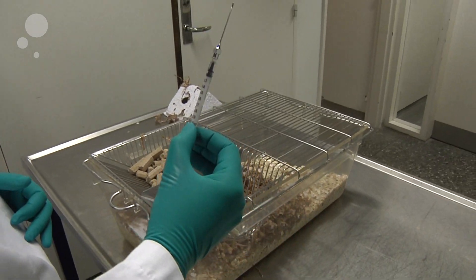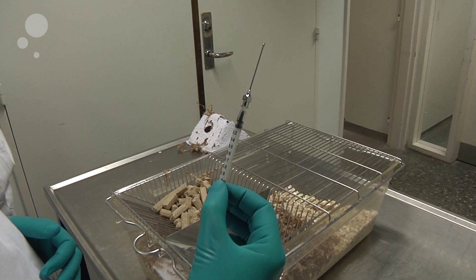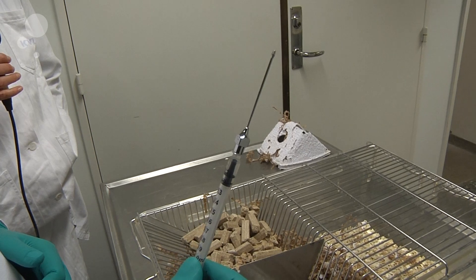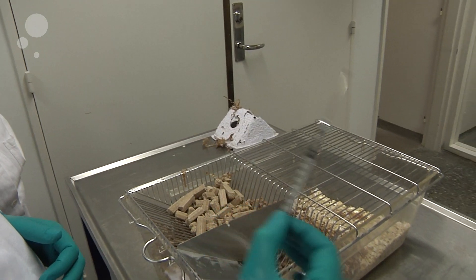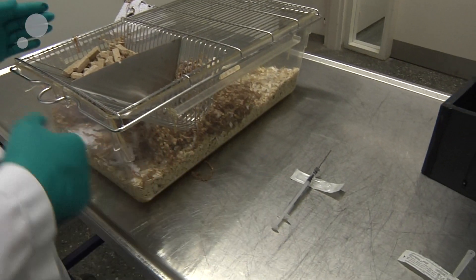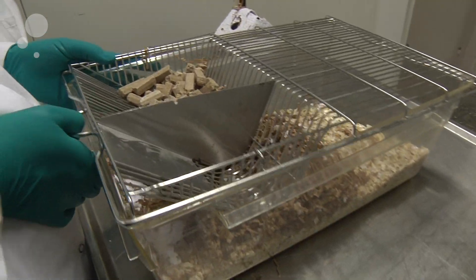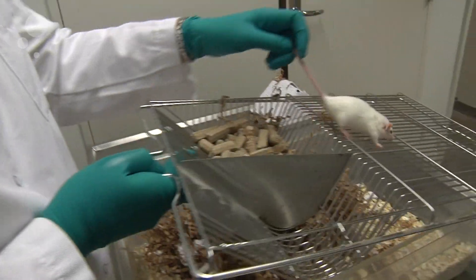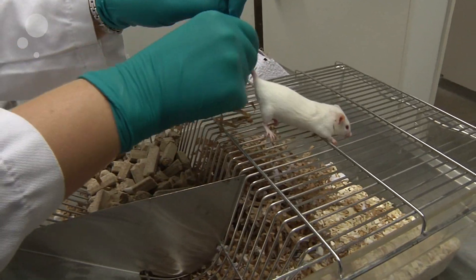For oral dosing of the mouse, you will need a gavage which is either made from stainless steel or from plastic. We have chosen one of stainless steel. For oral dosing, pick up the mouse in the cage, place her on the cage lid and scruff her for fixation.